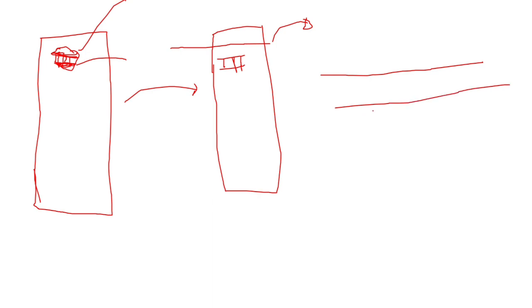For example, imagine that this is our probe. If a mutation is present at this part of our RNA, this part will get hybridized, but in this portion there will not be any bond formation. Here we will get a different signal from this part, that is, it has not been hybridized.